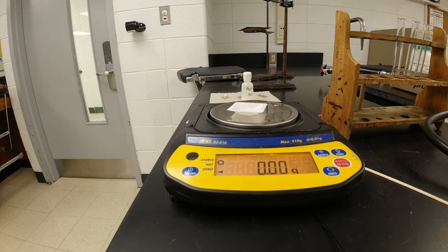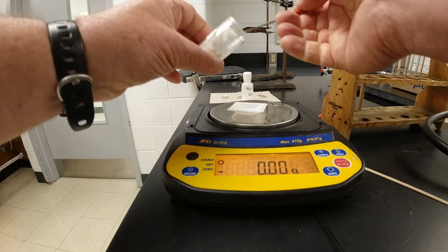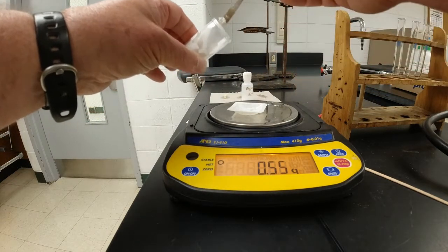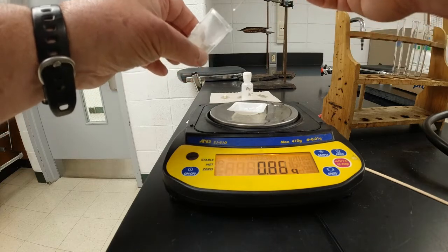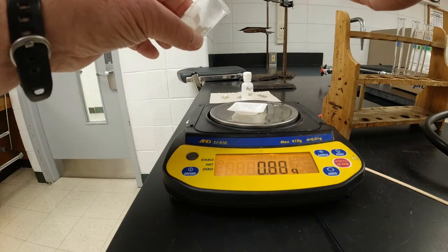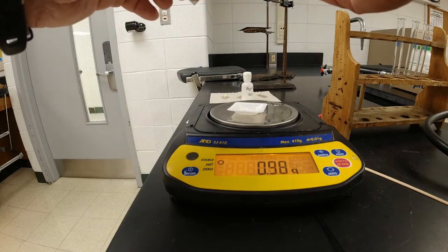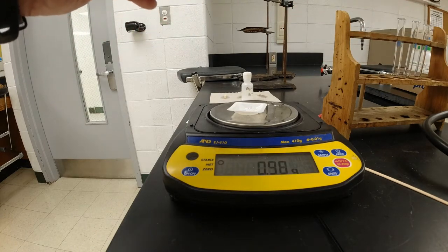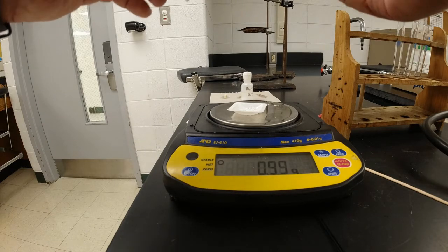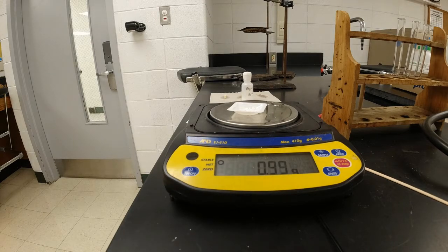Tare to 0. And I need 1 gram of barium sulfate. Whoop.